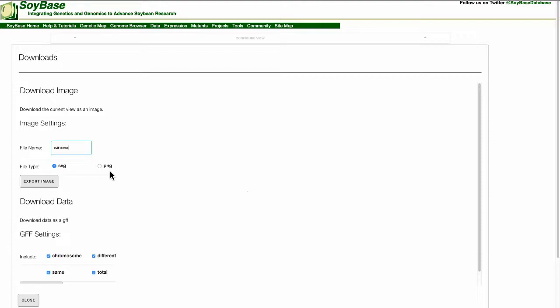In this example, I'm going to download the image as a PNG. From the download page, a user can also download the raw data as a GFF format.